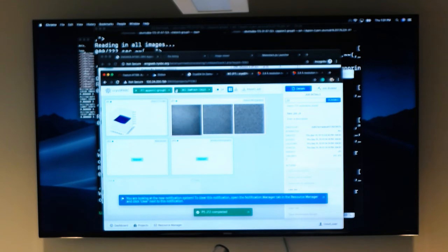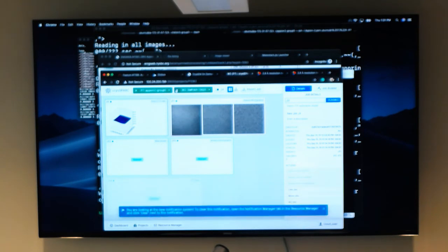Okay, so this is C1, and you're also applying C2 symmetry. So then you make up for it. If you only have two views and you have them on the right symmetry axis, actually you don't care, because in this case it would cover everything you would need. But if, let's say, you cannot apply symmetry and you have C1 and you only had a couple of views, then the map might be stretched in a few directions because you're overpopulating information. You don't have full angular coverage, which means you might have an orientation preference.